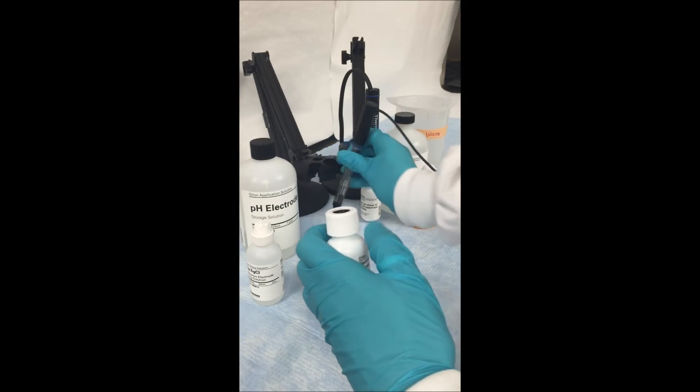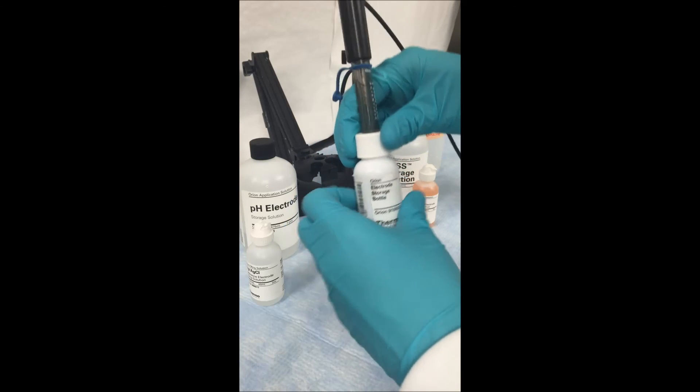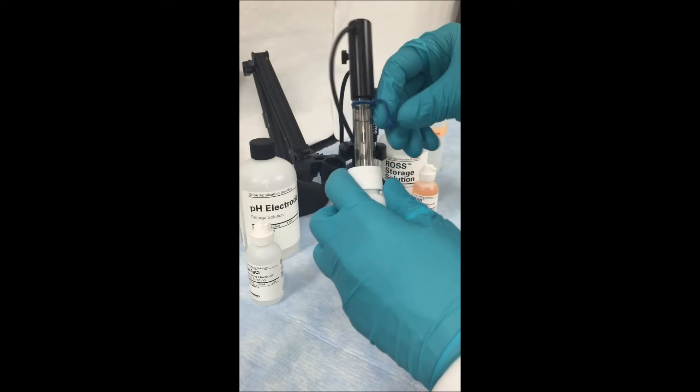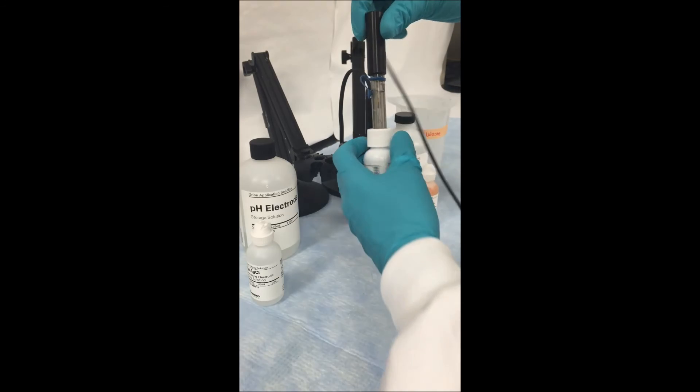To place your electrode back in the storage solution bottle, loosely fit the cap and slide the electrode in. Make sure to tighten the cap once the electrode is fully in and cover the fill hole for overnight storage.